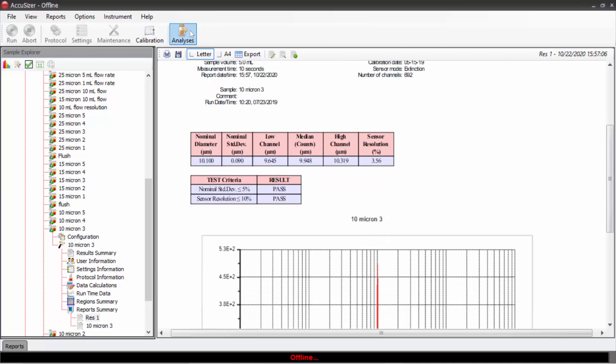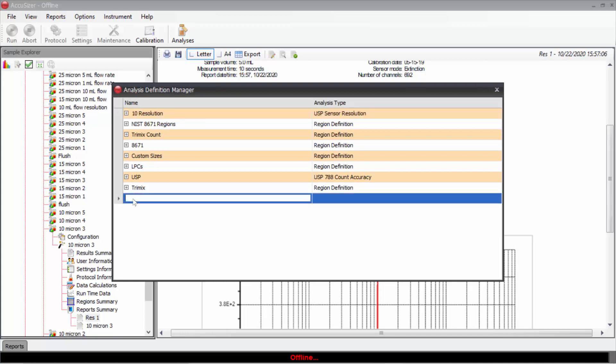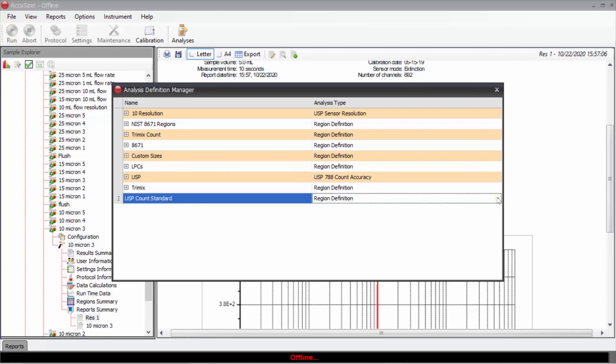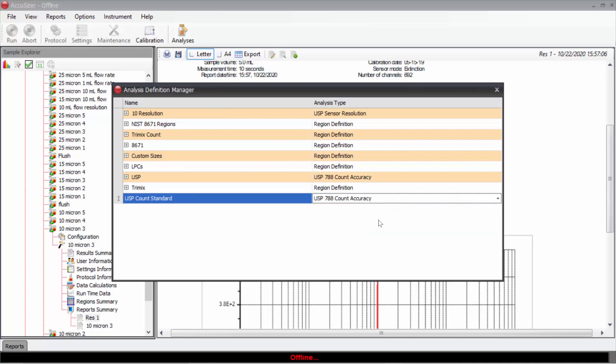I might also want to create the regions to do the USP count standard. So I'll come here and enter USP count standard. Come over here and select that as a type. So I'll do count accuracy.